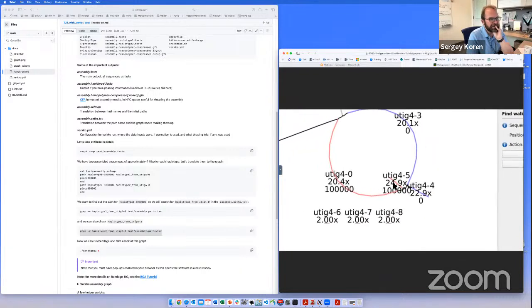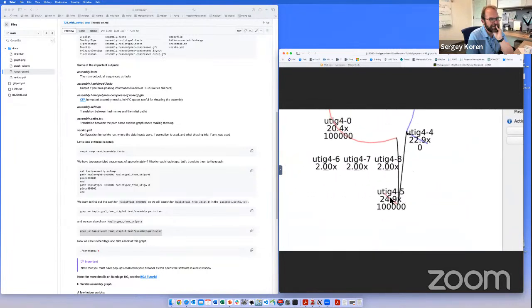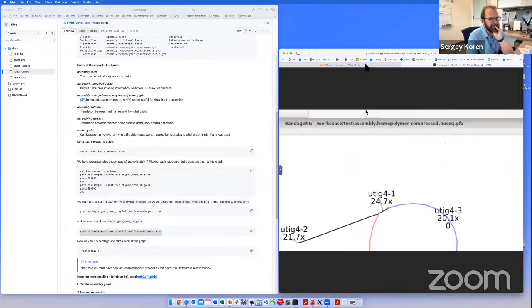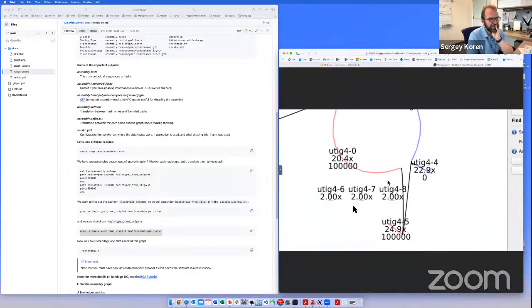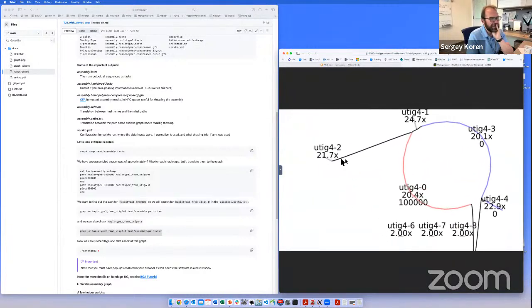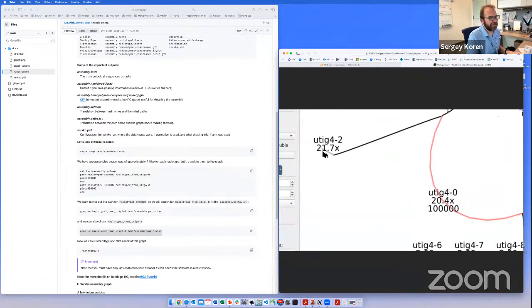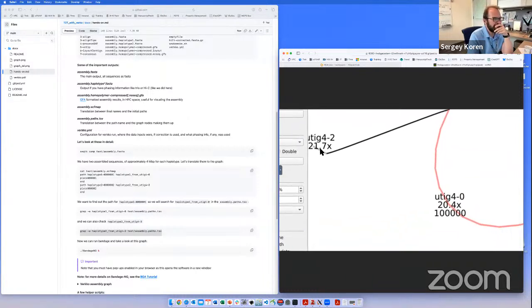So we took this node 4.5, right? I'm going to move it over so it's a little bit easier to see. So we started with 4.2, 4.0, 4.5. 4.2 is this one over here, which we took in the reverse, which you can see means we started from the little arrow bit. So we started from over here, and we went in this direction.